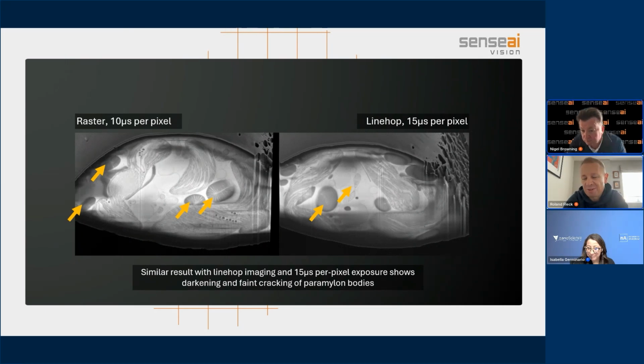Depends how stable your instrument is and how good your scan coils are. If you really want to push, if we're doing frame integration, because we do use the same external scan generator for that as well, we will motion correct the individual frames before assembly.